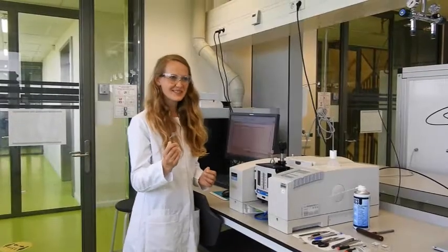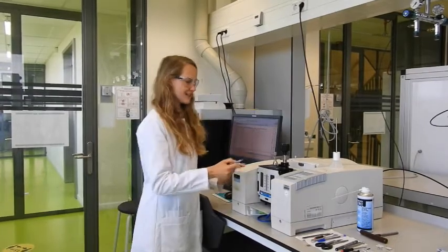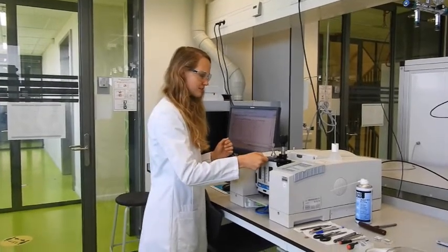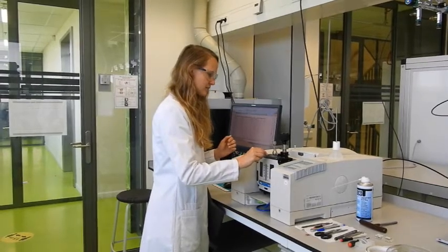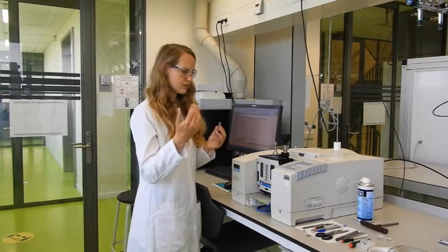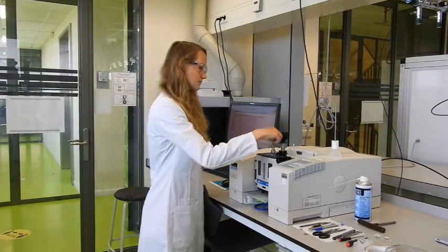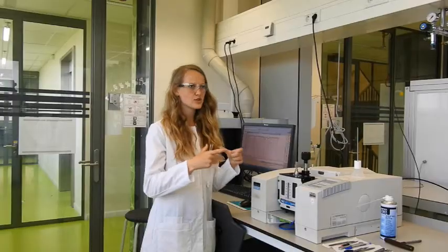So when we're looking at our sample, we can look at the surface of it with this GI-ATR. So it works in principle like a normal ATR, but with the grazing incidence of the beam, which then makes us able to only analyze the upper layer. And by varying the incident angle, we can even make a depth profile of the whole sample. So with this we get the information about the whole sample of our surface.